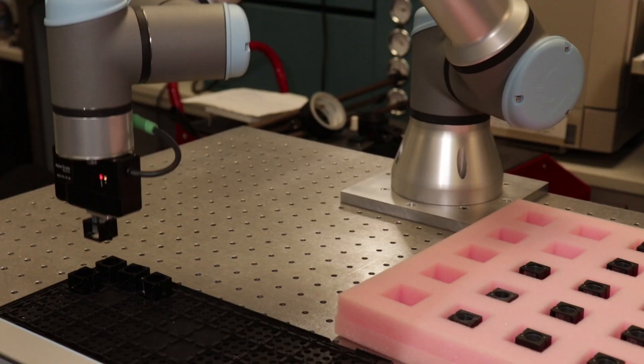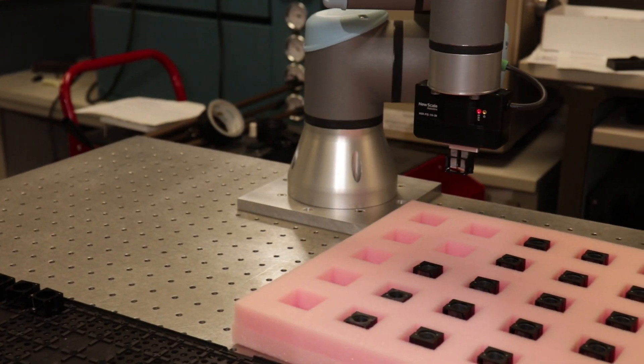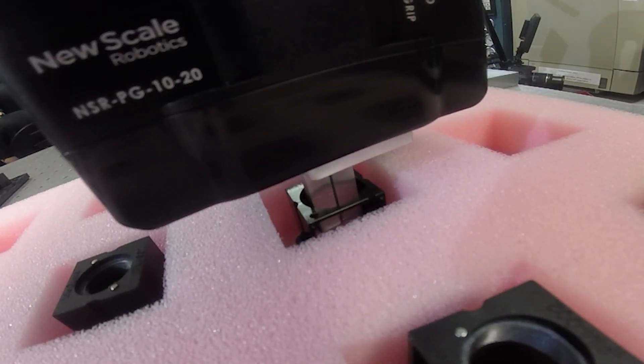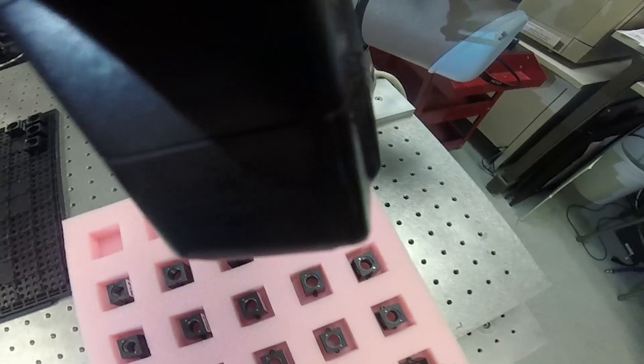This compact electric gripper is the ideal choice for intricate part handling and measurement tasks. You will not find this kind of precision anywhere else.